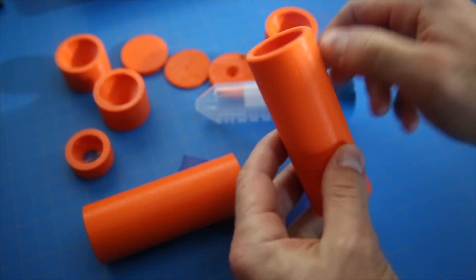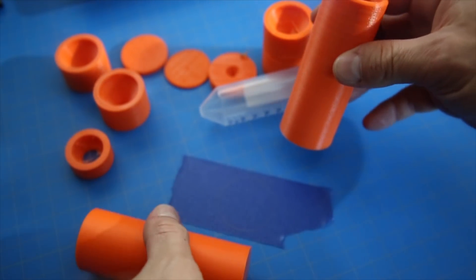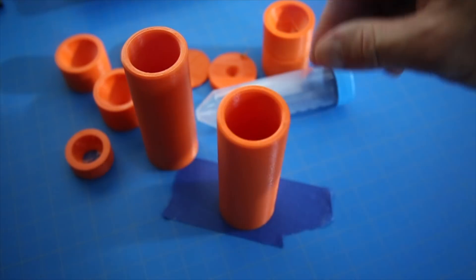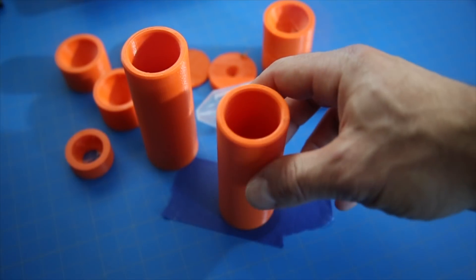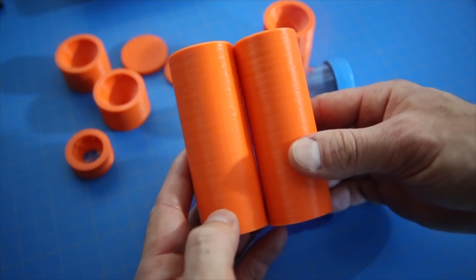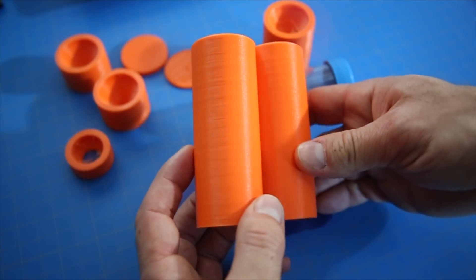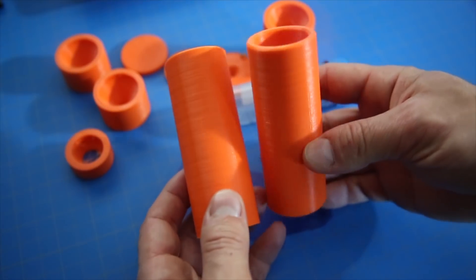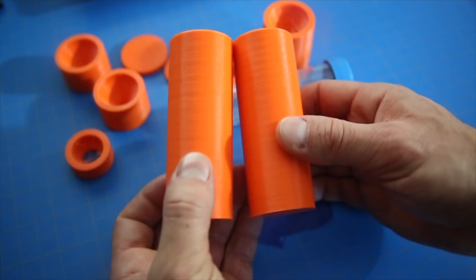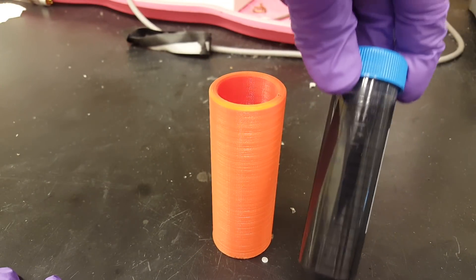Hey everyone, this is just a quick follow-up to the 3D printed test tube centrifuge adapters project. My buddy was able to take some video of him performing science for internet enjoyment to show the adapters in action, as well as all the test prints that are handy to have as test tube stands. That said, the rest of this video is his work, so hit that thumbs up if you think he needs his own channel, and thanks so much for watching.